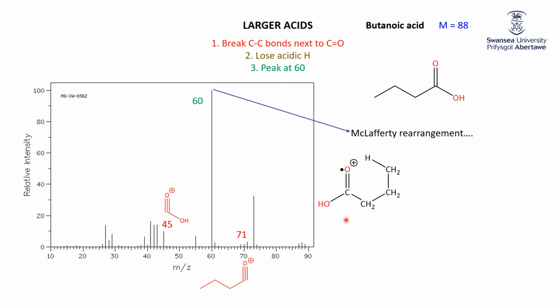Okay. Now, the electron rearrangement that takes place is relatively familiar. First of all, we break a bond between the carbon and the hydrogen to make a bond between the oxygen and the hydrogen. We've seen this a couple of times before, specifically for losing water. Now, at that same time, within the carbon ring, you have pi electrons come from the carbon-oxygen bond down here to make a double bond to this carbon. This carbon at this stage says, hey, that would give me 5 bonds, so I'm going to lose the electrons to this carbon, which it then loses to form a double bond to the carbon that lost the hydrogen.